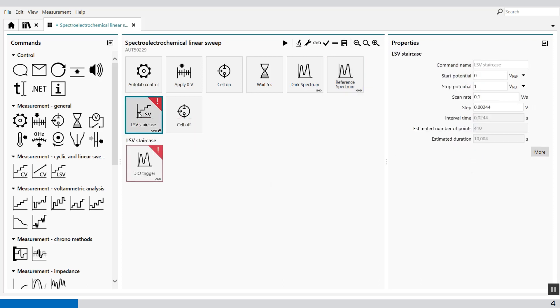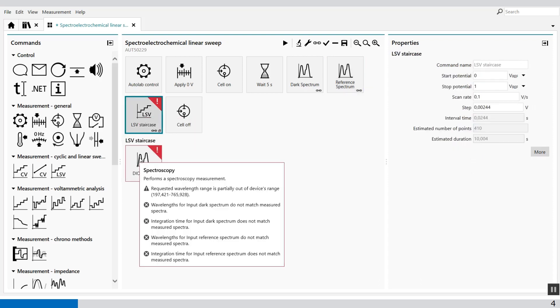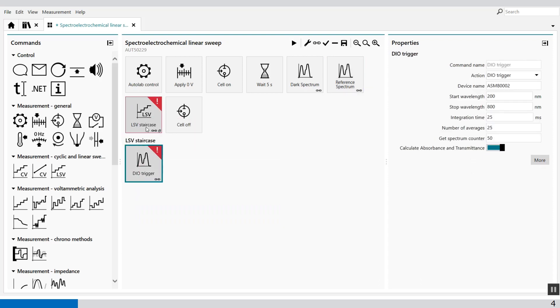The same I have to do in the DO triggering in the LSV. From 300 nanometers to 500 nanometers with the integration time of 10 milliseconds.